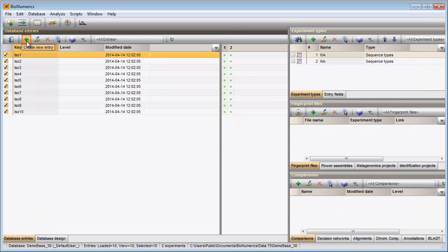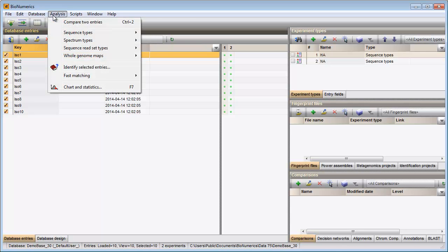This window can be called again with the menu item, analysis, sequence types, batch assembly reports.